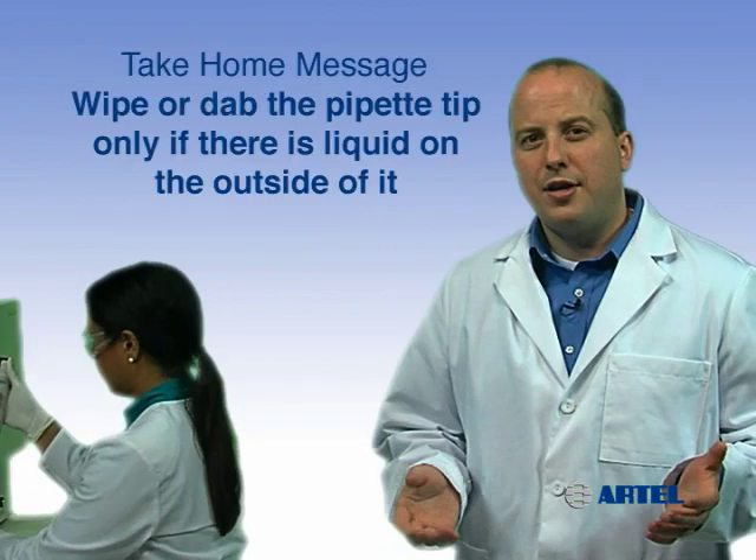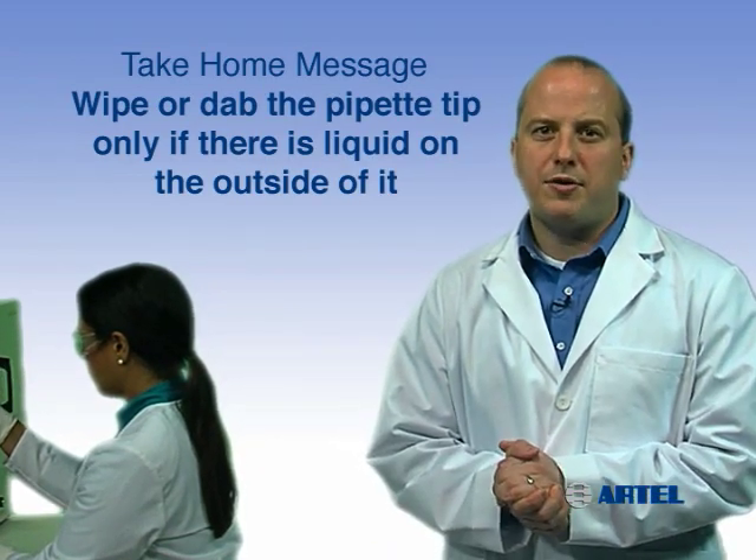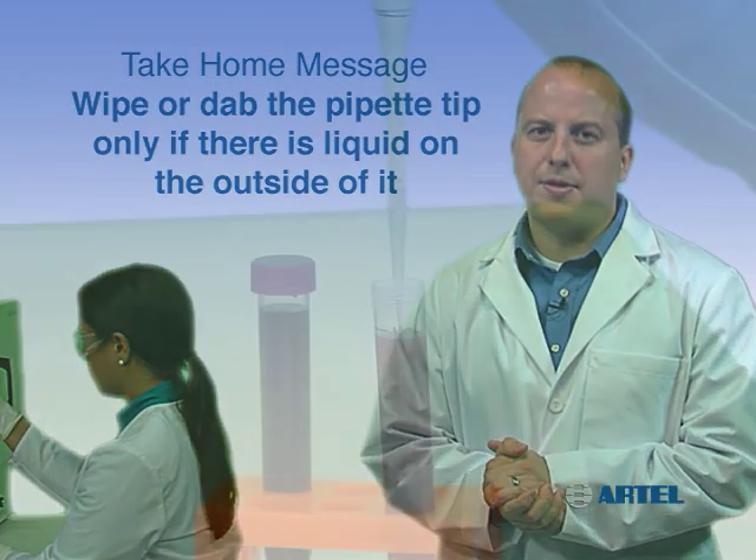The take-home message is: if there are liquid droplets on the outside of the tip, wipe or dab using a lint-free cloth. Avoid wiping near the tip opening.